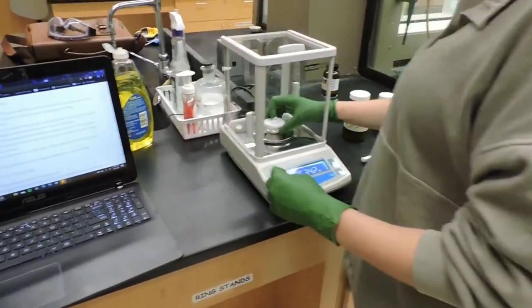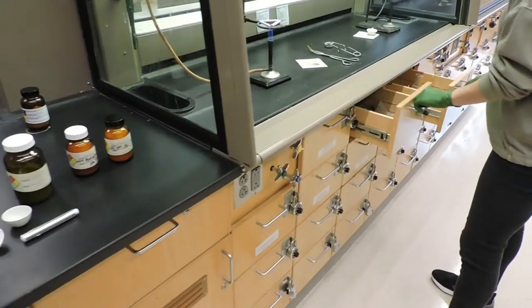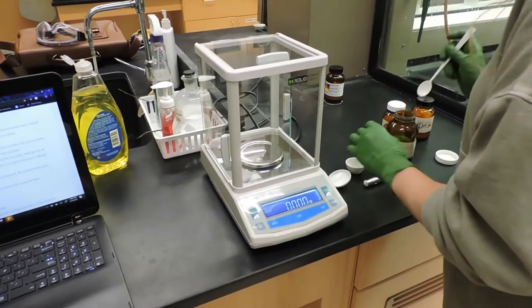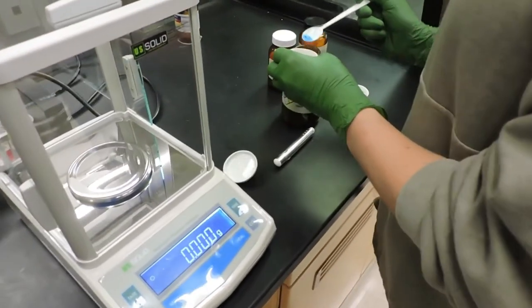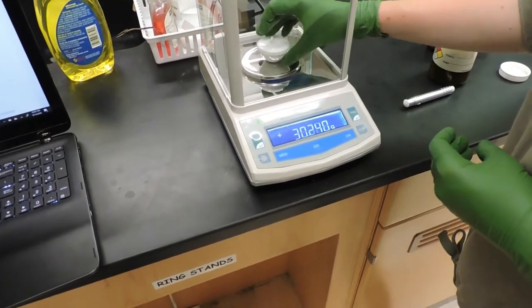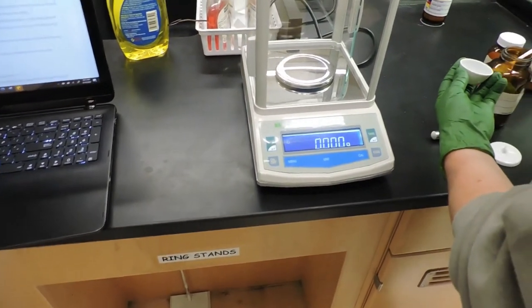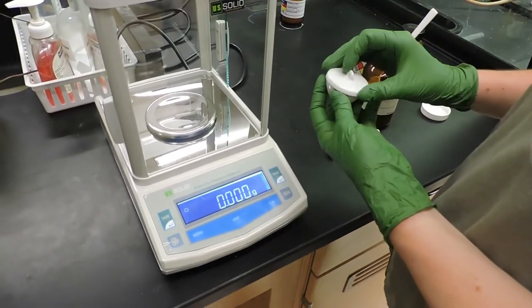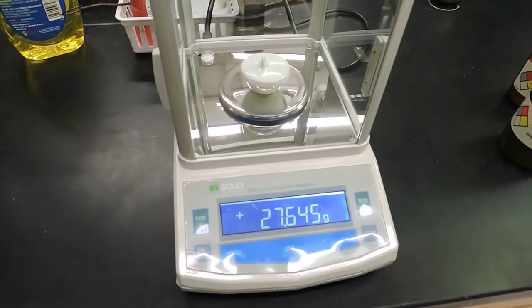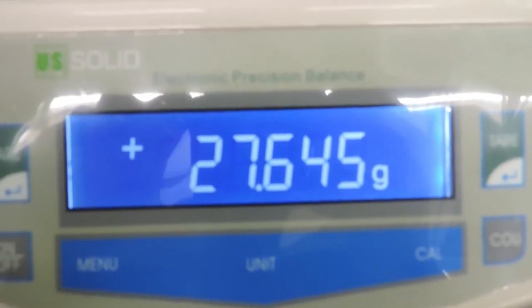After finding the mass of the crucible and lid, we're going to place between 1 and 1.5 grams of known hydrate, in this circumstance, copper sulfate pentahydrate, in the crucible. Then we will find the mass again with the crucible lid and the copper sulfate pentahydrate. The mass for the crucible, lid, and copper sulfate pentahydrate is 27.645 grams.